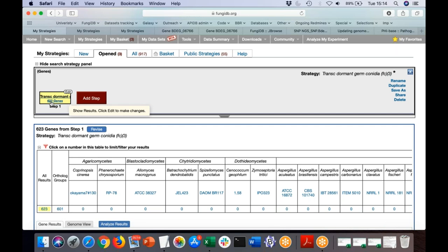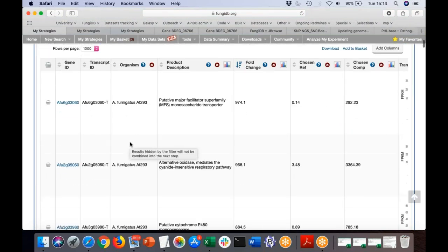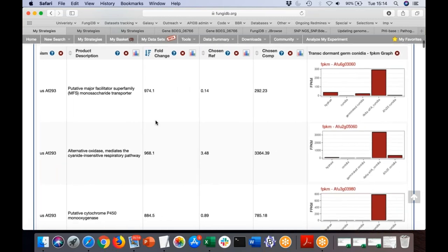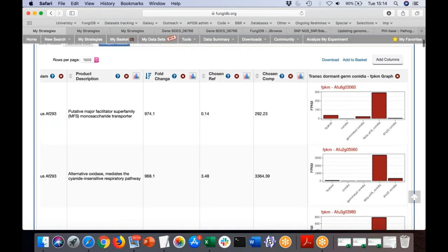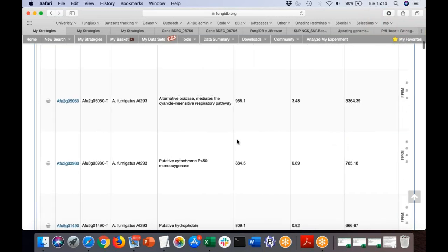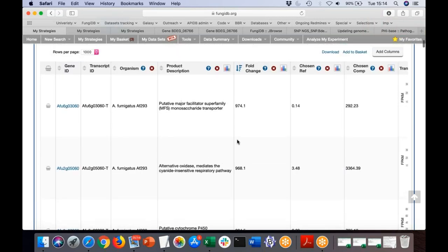What this means is that deletion of ATFA, in addition to housekeeping genes, may reveal genes directly regulated by ATFA. As a researcher you would explore individual genes in this list, look at their expression profiles shown in the graph, and examine what kinds of genes are represented. You can analyze results by GO term enrichment, for example.